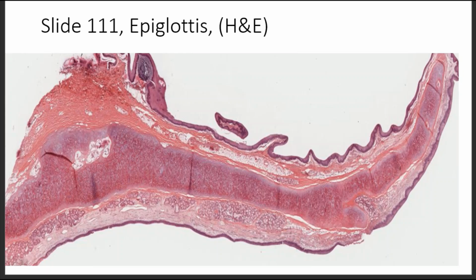So the slides, let's start with the epiglottis. This is the epiglottis. The epiglottis is made up of this epithelium that is non-keratinized stratified squamous epithelium.